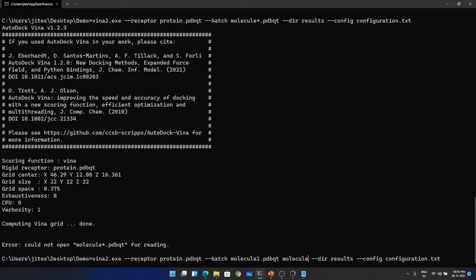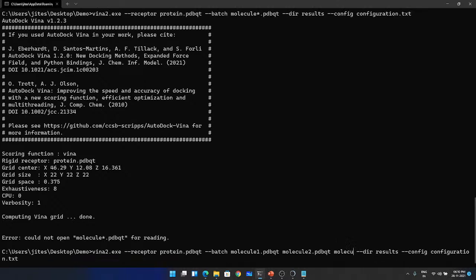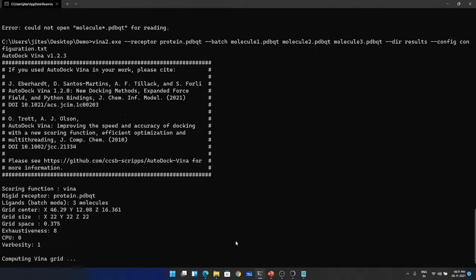The reason why I'm using different files is that it can actually do this individually, and each file name will be used for storing the result. That's the reason I have used individual files. I'm just going to give 3 for now, not all of them. I will show you how to do that pattern one in just 1 minute, and simply start it.